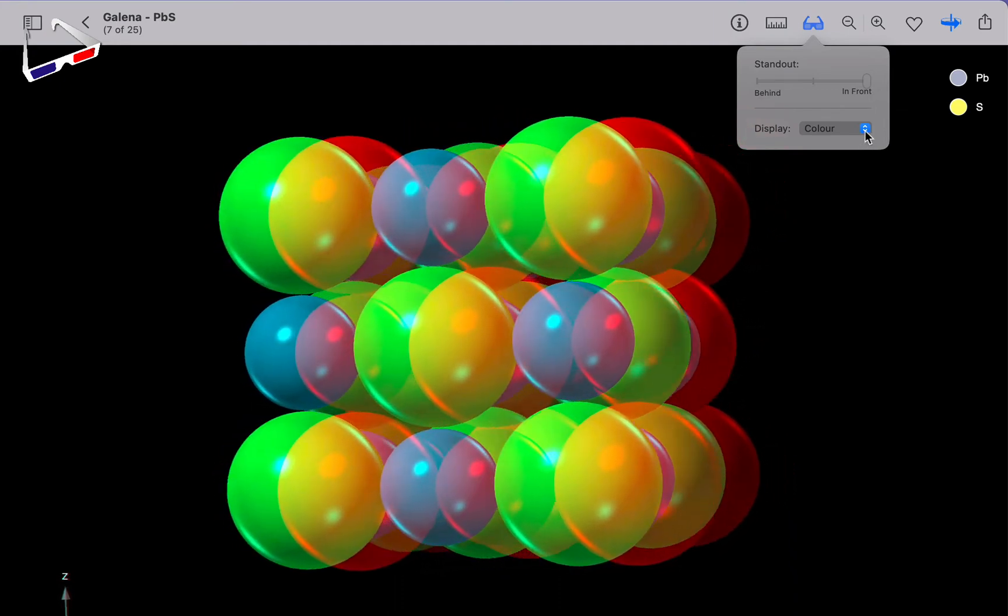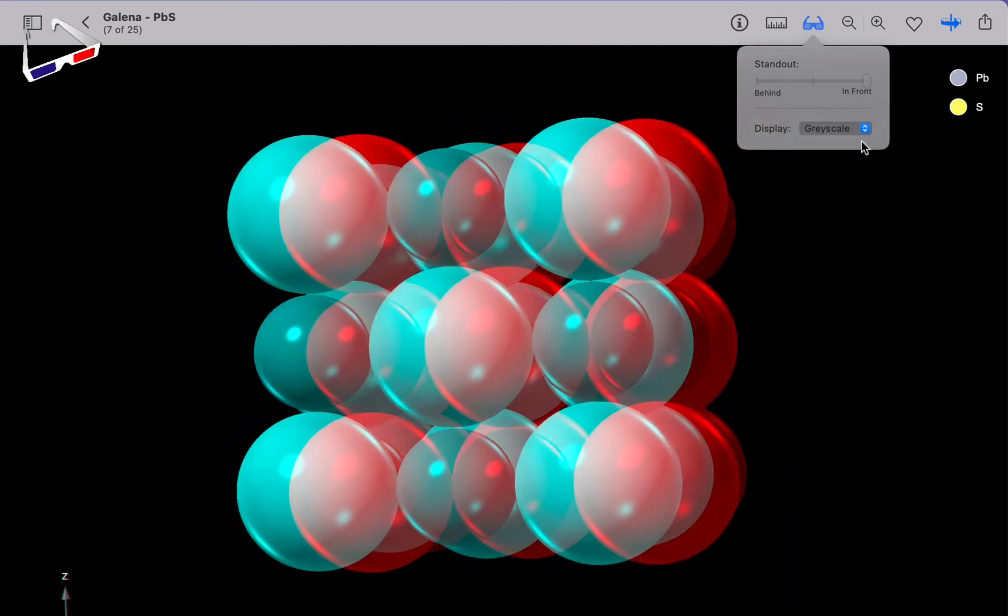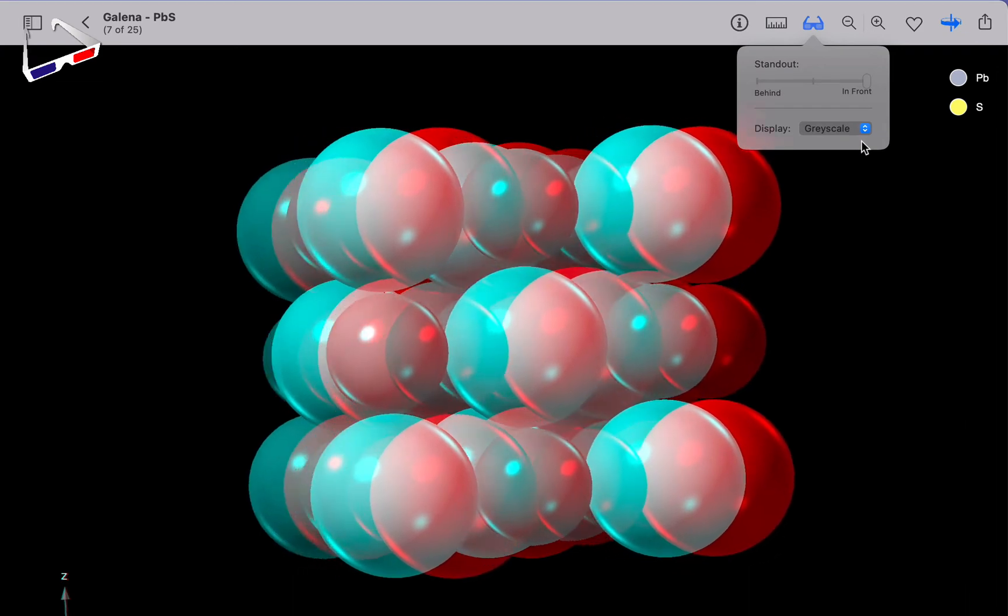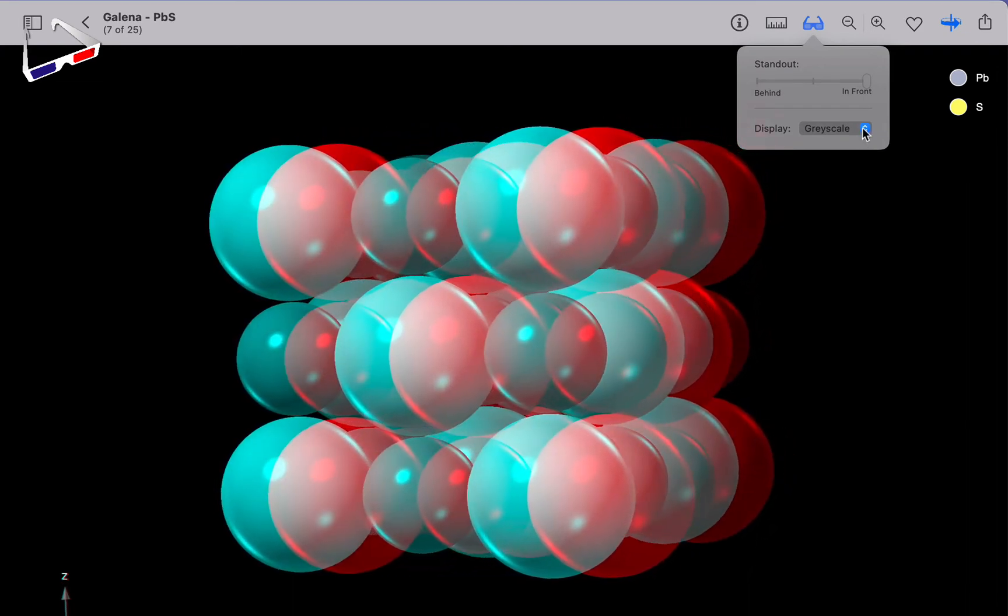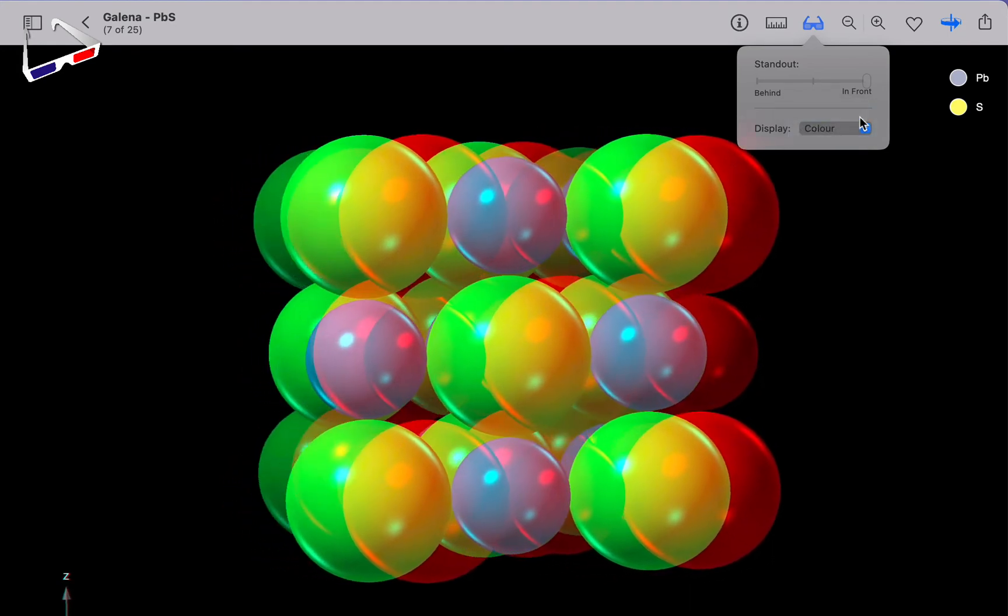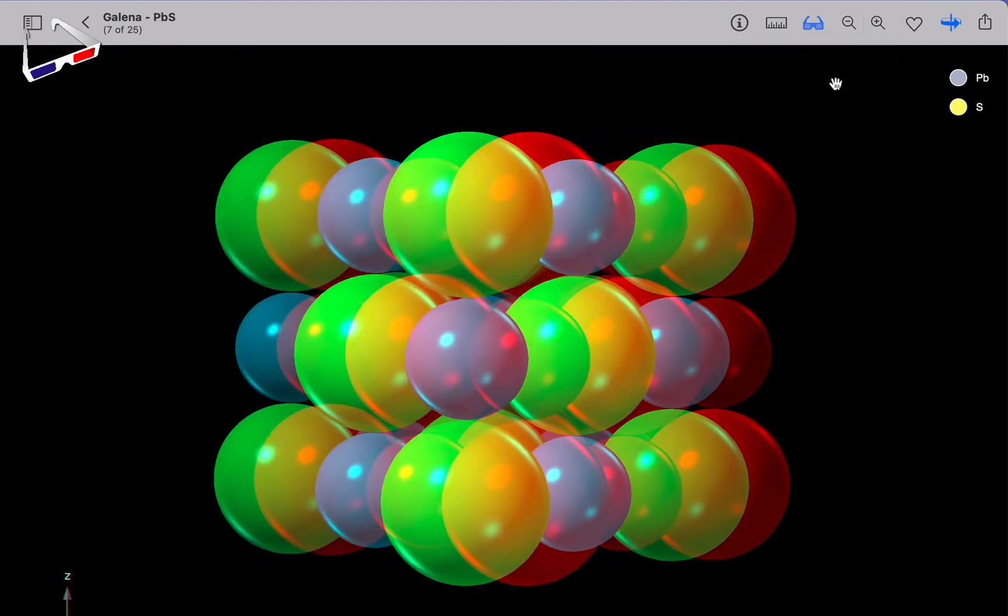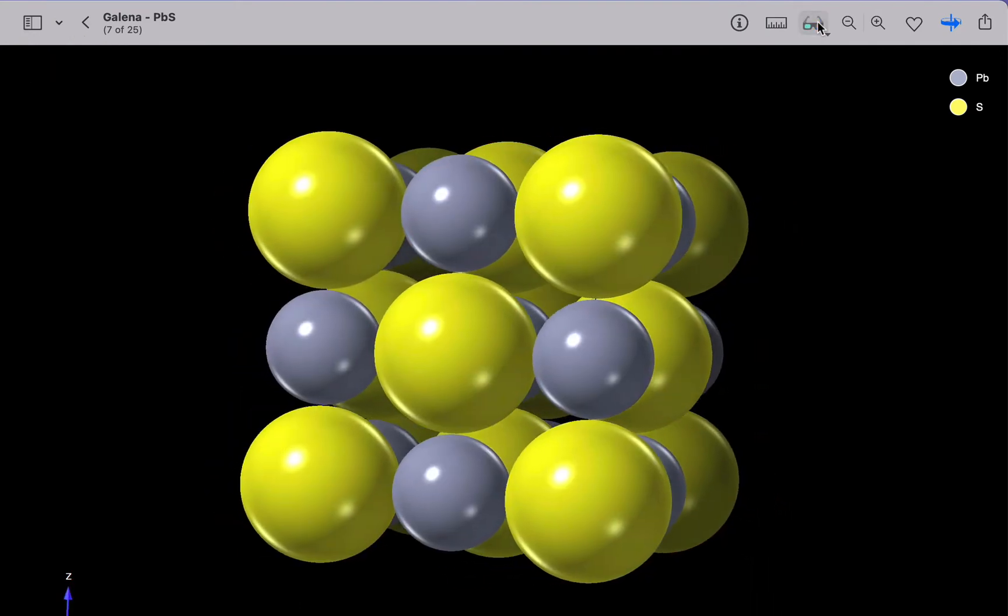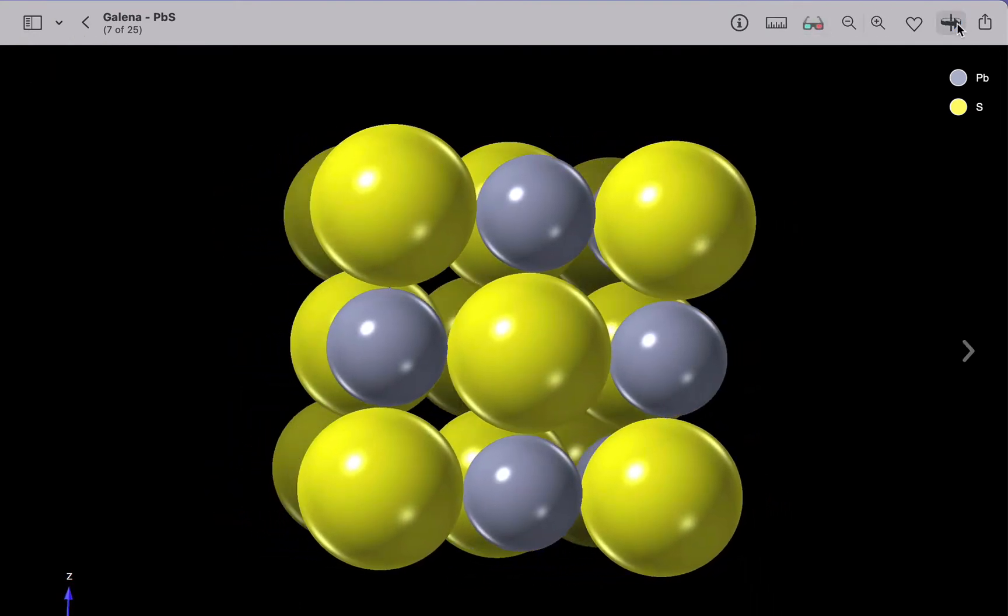Now you do also have the option of switching to a grayscale viewing mode. Some people find that more comfortable, but it's not quite as impressive as colour stereo. OK, let's turn off the stereo by pressing this button here. Let's turn off the auto-rotation.